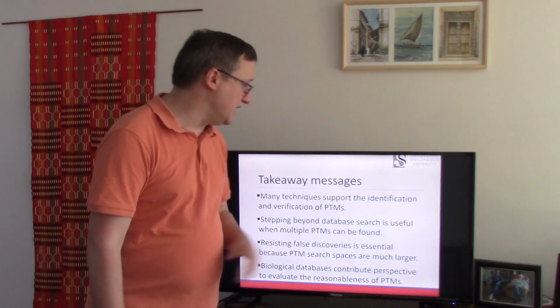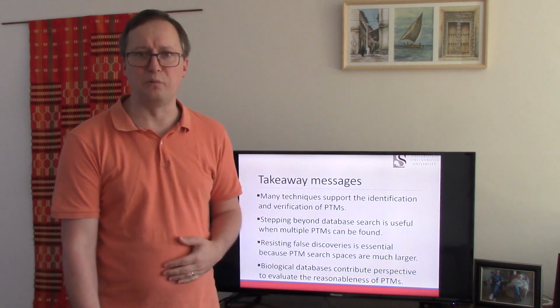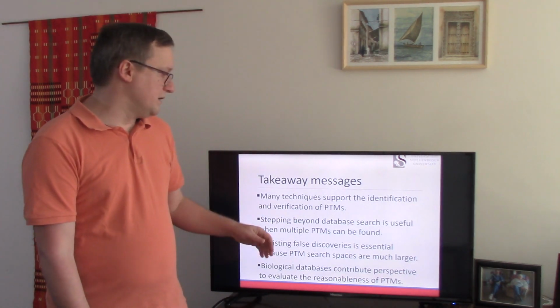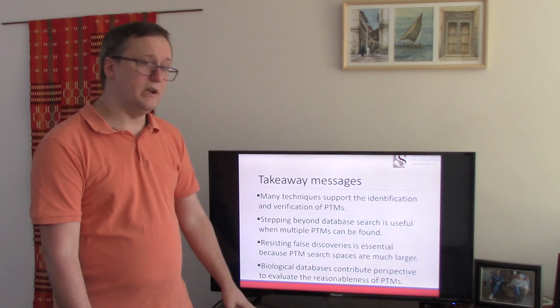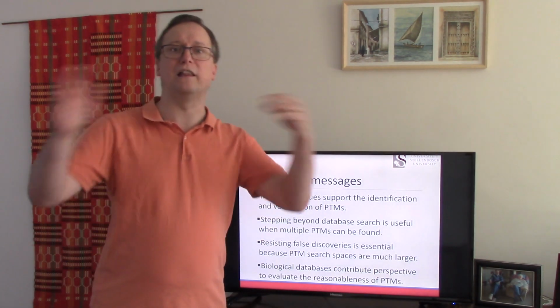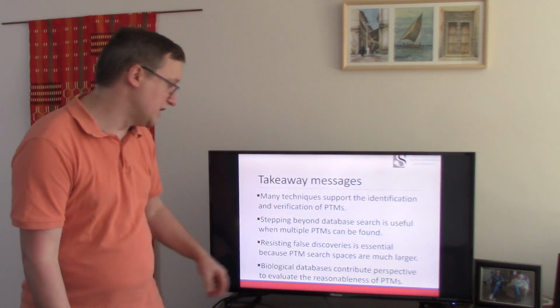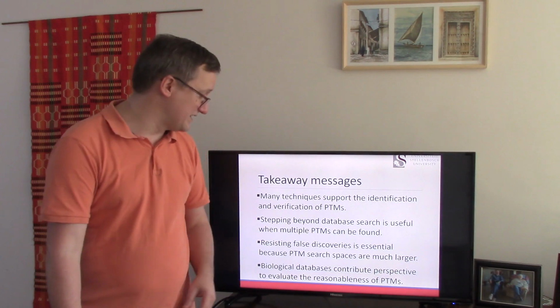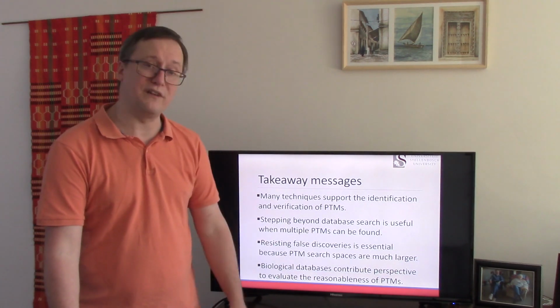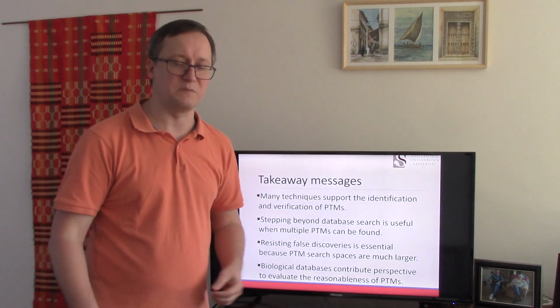So there are lots of techniques now for identifying and verifying post-translational modification data. Stepping beyond database search is good because anytime you're trying to look for a whole palette of modifications, you really need tools that are going to support that better. Resisting false discoveries is essential because post-translational modification search spaces are much bigger than standard ID search spaces.